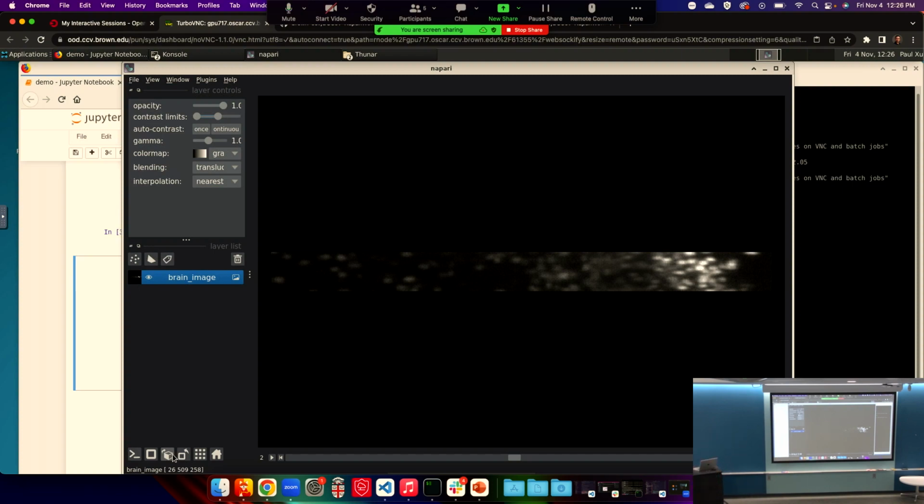Maybe this is a fine detail, but specifically for this kind of data, it's common for the pixels in a single image to not be the same scale as the spacing between planes. Yeah, absolutely. Is there a parameter here somewhere where you can tell it how much distance there is between each successive plane? I don't think that's available right now, but that is a very good point. You can see that in this one, the resolution on the z-axis is not the same as on the other axes. I'm not sure how they are fixing that problem, but that's a great question.